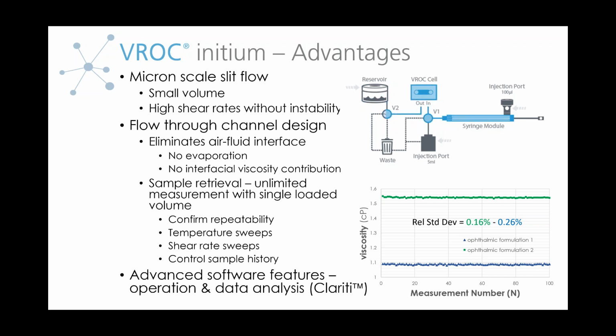Also, if you're trying to predict flow through, say, a needle or a syringe, then this can involve high shear rates. So if you're looking to determine the flow behavior, determine whether your material is Newtonian or non-Newtonian over a broad range of shear rates, then the system is going to be very useful for that, because the small scales of the flow channel reduce the possibility of having hydrodynamic instabilities or turbulence at high shear rates, which is a problem when you're dealing with different types of instrumentation where the length scales are much larger.